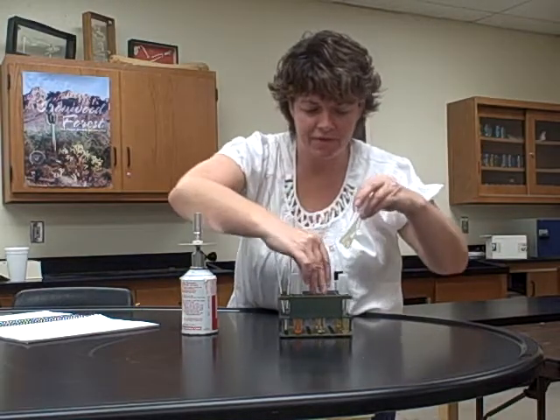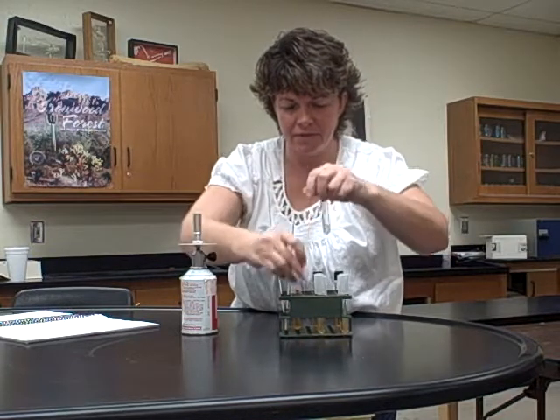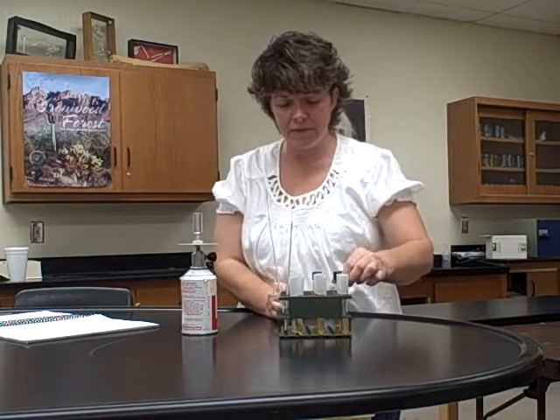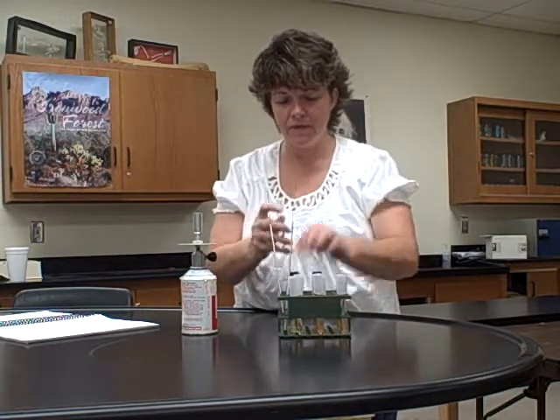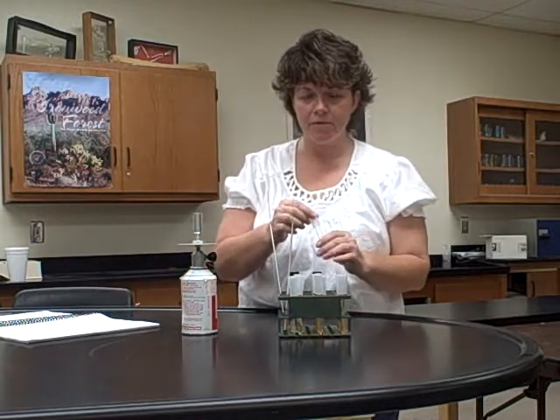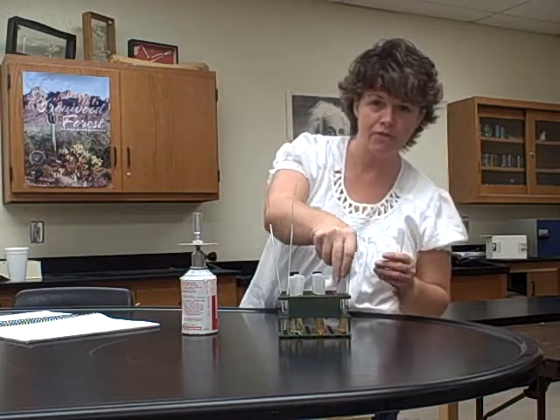I should have it this way, where I have a broth, a slant, and a deep for each bacteria, okay? So I'm going to pretend that this bacteria here is the Lactococcus lactis. So I'm doing the first one, okay? And remember I told you to use all your hands and all your fingers, okay? So I'm going to go into the broth first.